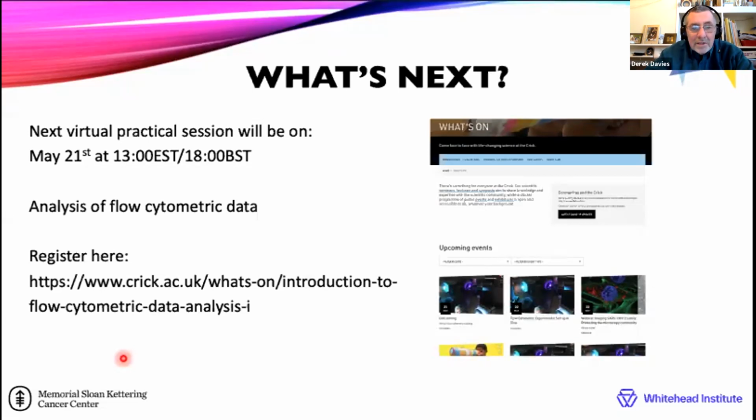We'll look at things like gating and which plots you're likely to use, which metrics you might derive, and how you output data that you might want to put into a paper or publication or a lab meeting or whatever.